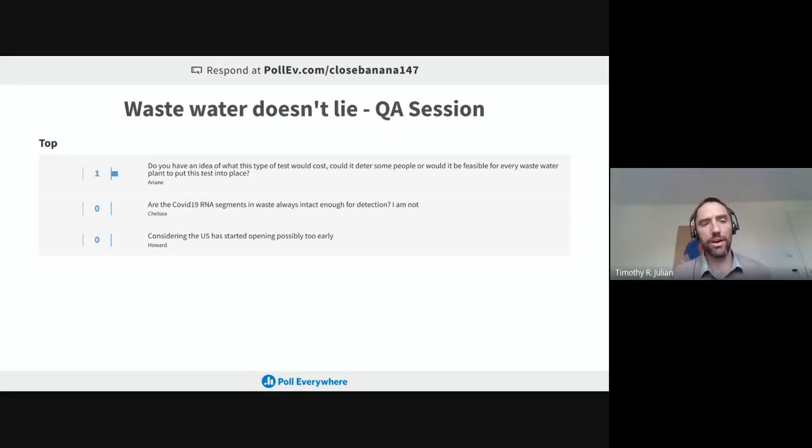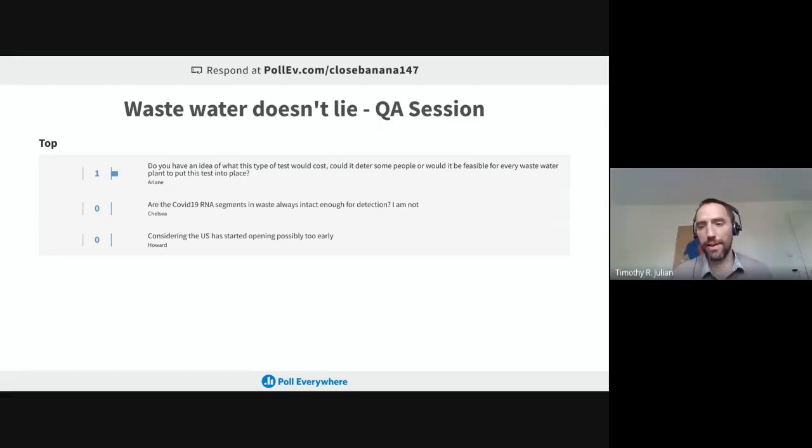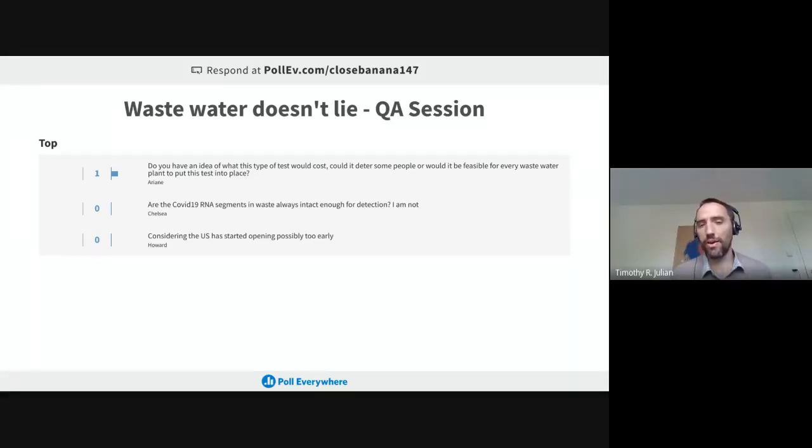So the estimated costs we have right now is basically method development. So it's not at scale. It's not a commercial kit or anything. It would be about 150 to 200 Swiss francs per sample. Just consumables, right? Yeah, just consumables, plus labor. Sorry, can you repeat how much that was? Just consumables at our scale, 150 to 200 Swiss francs per sample.